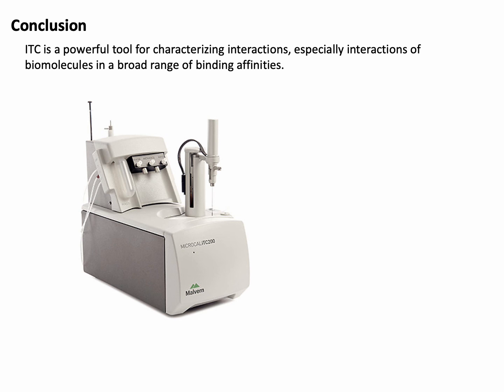In a nutshell, ITC is a powerful tool for characterizing interactions, especially interactions of biomolecules, across a broad range of binding affinities. Hope this short presentation could let you have a general idea of this technique.